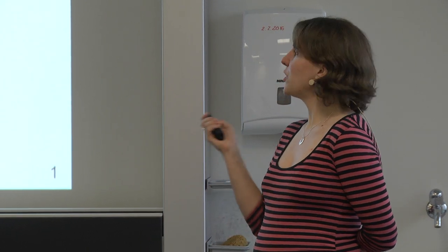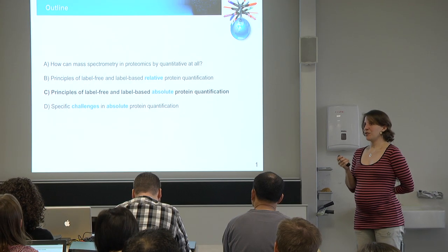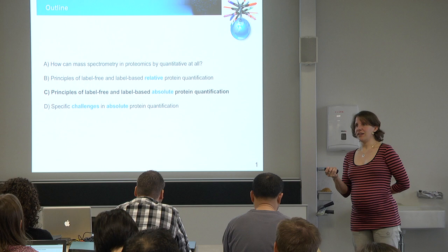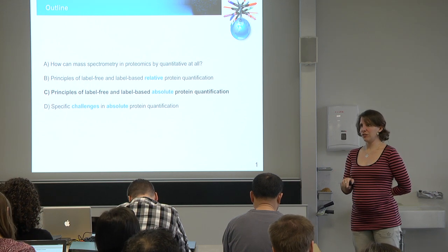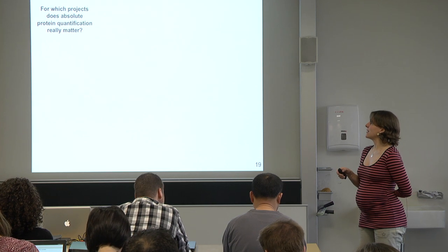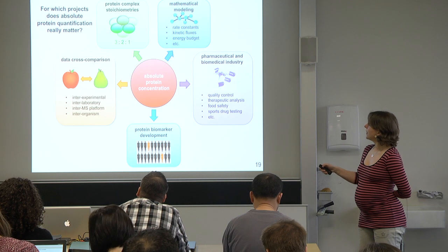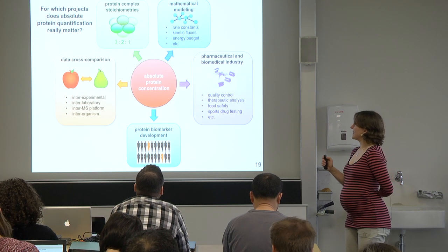Okay, so which are projects where you need absolute protein quantification? Because there are actually not so many out there. Very often relative quantification is absolutely okay to answer your biological question of interest. But there are some approaches where it does make sense to do absolute quantification, and they are all shown here. At least, maybe not all, at least all the ones that I know of.